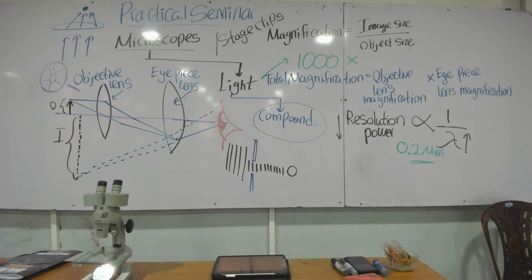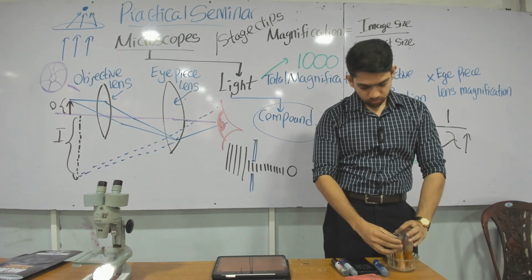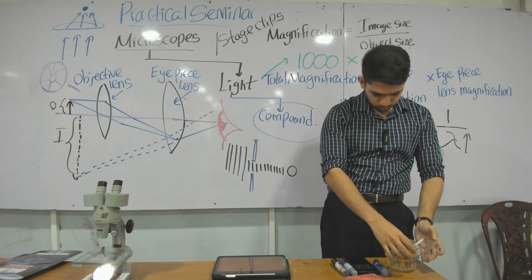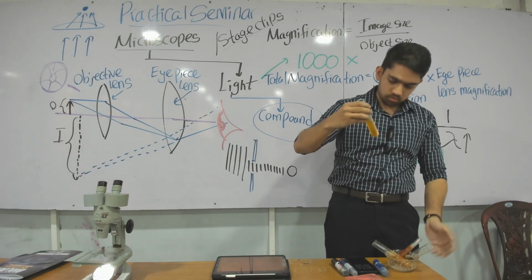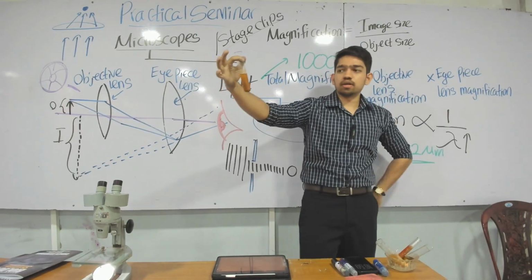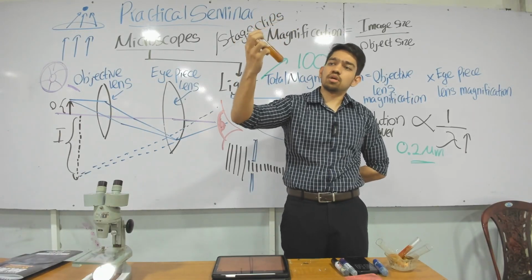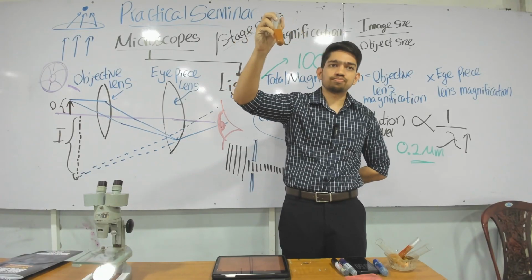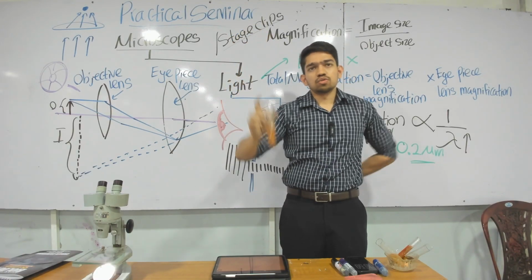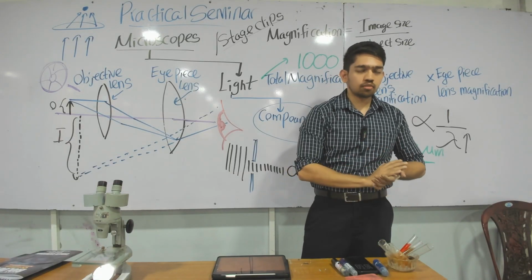Anyway, a quick summary of what we did today. We started with the reducing sugar test. With glucose you put Benedict's and heat, and there's going to be a color change from blue, green, yellow, orange, until there's a precipitate at the bottom. With further oxidation there are different colors, so you only need to remember the sequence of color changes.